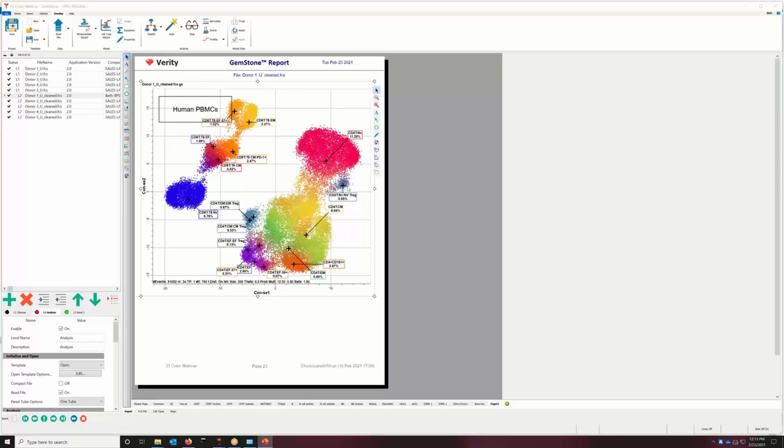There's a naive Treg population, which would be 127 low and CD25 positive. And then again, there's an effector memory Treg population. There's another little population down here that's 161 positive, and a little 56 positive, 57 positive effector. So you can really start to see those populations resolve, and any other named populations that you can see gives you a chance to start really delving into those populations.